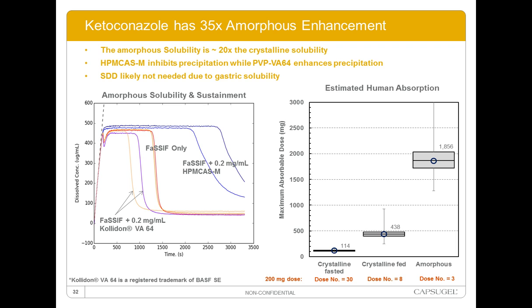And then we looked at this also by adding 2 different polymers into the media. The one to the left in yellow and purple is adding a PVPVA to the media. And we see that the induction time for nucleation of crystals actually decreases by almost a factor of 2 when we have PVPVA around.